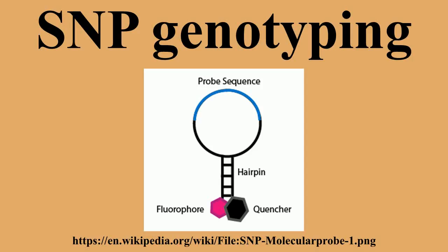Primer extension probes can be arrayed on slides, allowing for many SNPs to be genotyped at once. Broadly referred to as arrayed primer extension, this technology has several benefits over methods based on differential hybridization of probes. Comparatively, APEX methods have greater discriminating power than methods using this differential hybridization, as it is often impossible to obtain the optimal hybridization conditions for the thousands of probes on DNA microarrays. However, the same density of probes cannot be achieved in APEX methods, which translates into lower output per run.